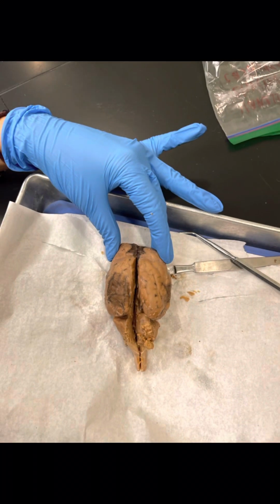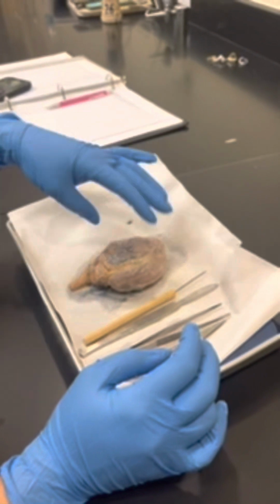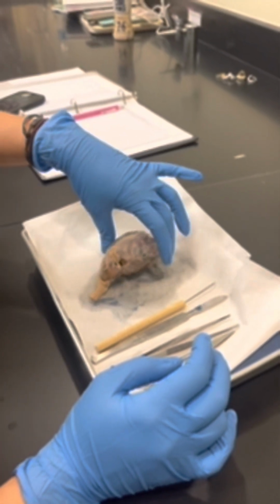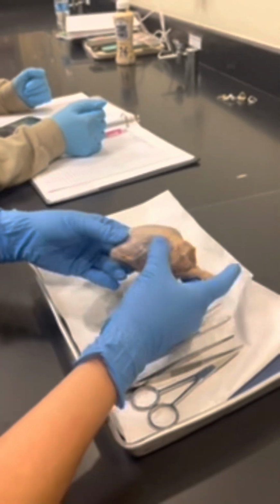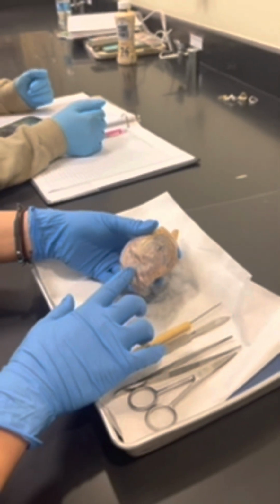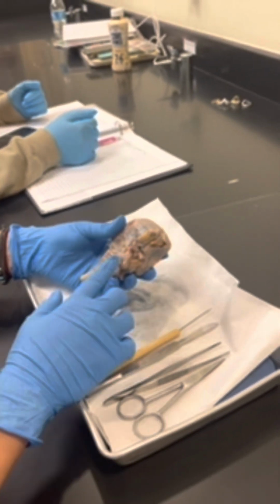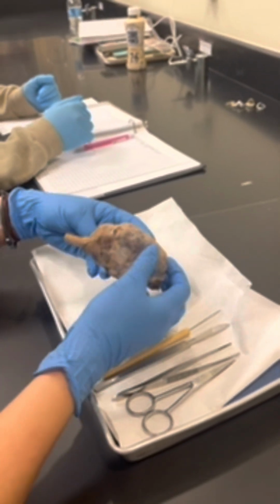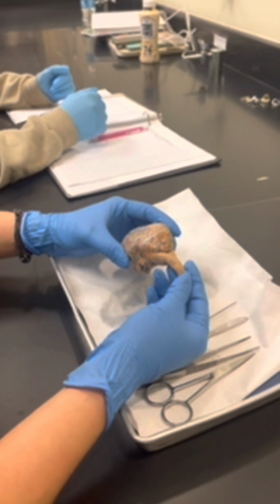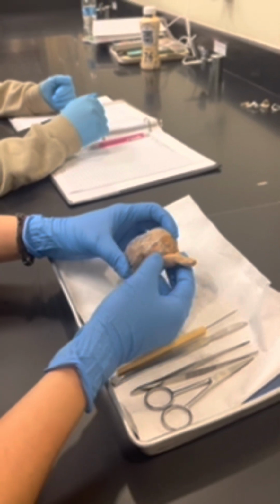In this section, I will talk about the different areas outside the brain. The sheep brain will be the example I will use. I will start by pointing at the anterior portion. I will then turn it over to the inferior portion to show in the brain where the eyeballs of the sheep would be at. I then grab the spinal cord, which is posterior of the brain.